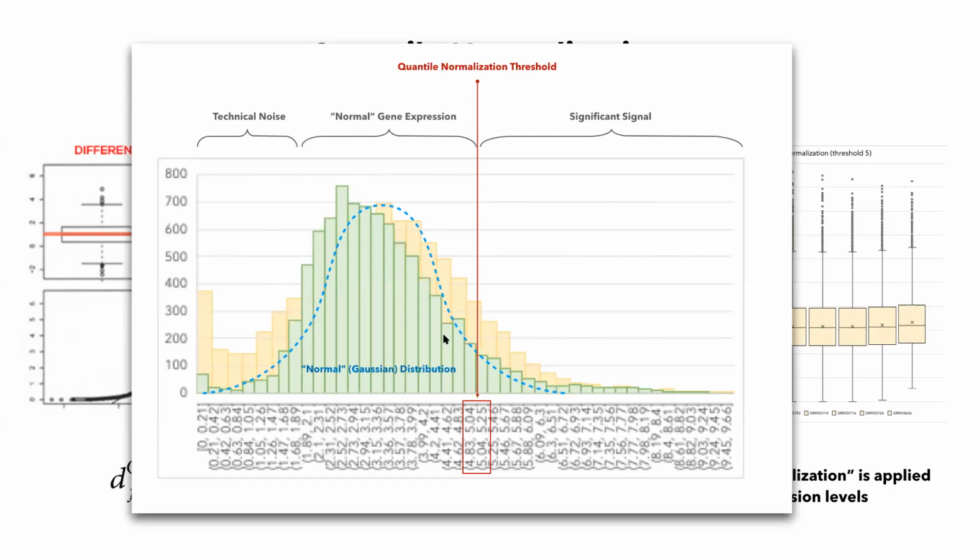What do you want to compare? Well, you want to compare those things that are different, right? So the best way to describe something different is if you have a lot of information about those different things. And those are the significant signal. Those are the highly expressed genes that actually affect the characteristic of that cell function or of that cell condition. And you also have this technical noise. This technical noise comes from low expressed genes. They're expressed at such a level that even if you compare them between different conditions, they won't give you enough information to determine whether that is noise or that is signal.